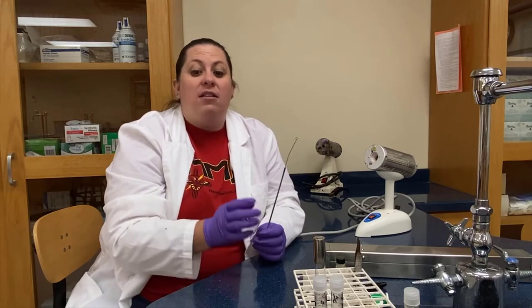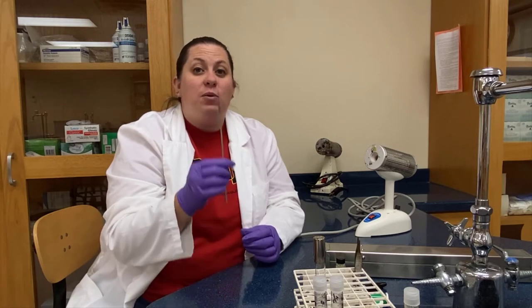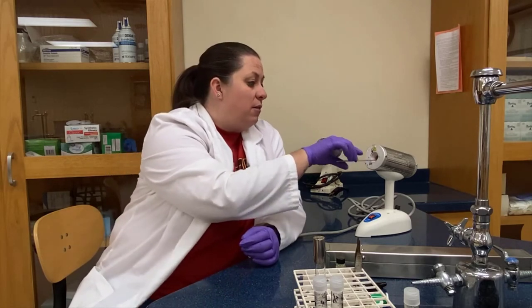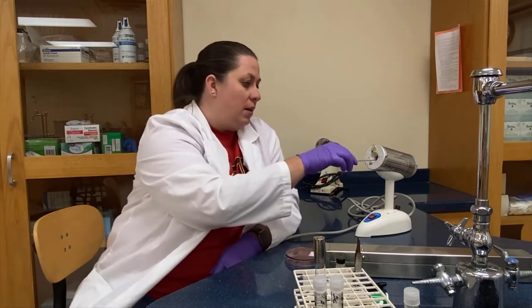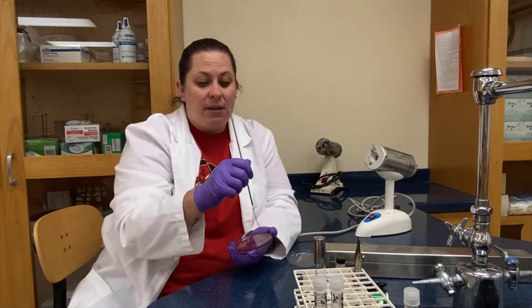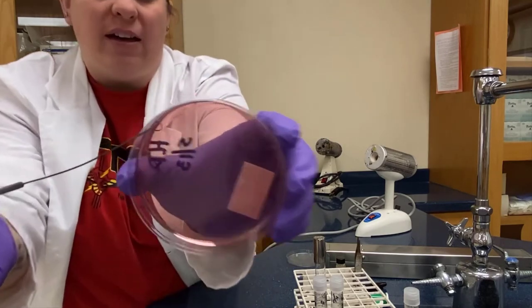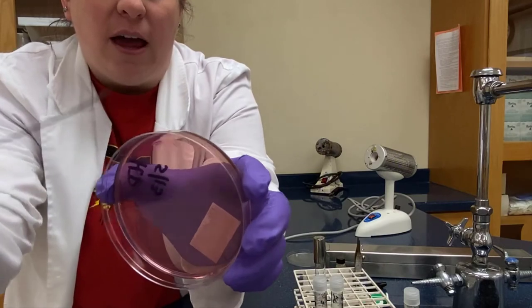We're not going to wave the loop to cool it off either, as we're potentially contaminating it. When sterilized and red, we hold on to it until it cools, then utilize it on our plate. We need to wait until it cools because if we don't, we can end up killing the bacteria as we transfer it, which means it won't grow like we want, or it can burn through the agar. If we put the loop in, heat it until it turns red, and don't wait for it to cool, you'll hear a sizzle and it will put a hole through the agar.